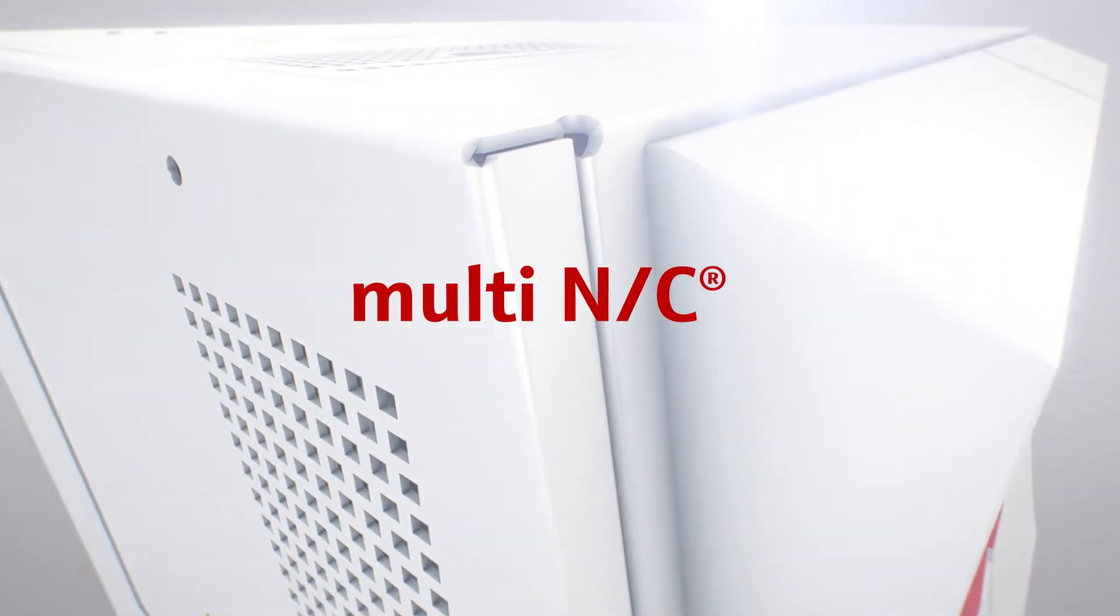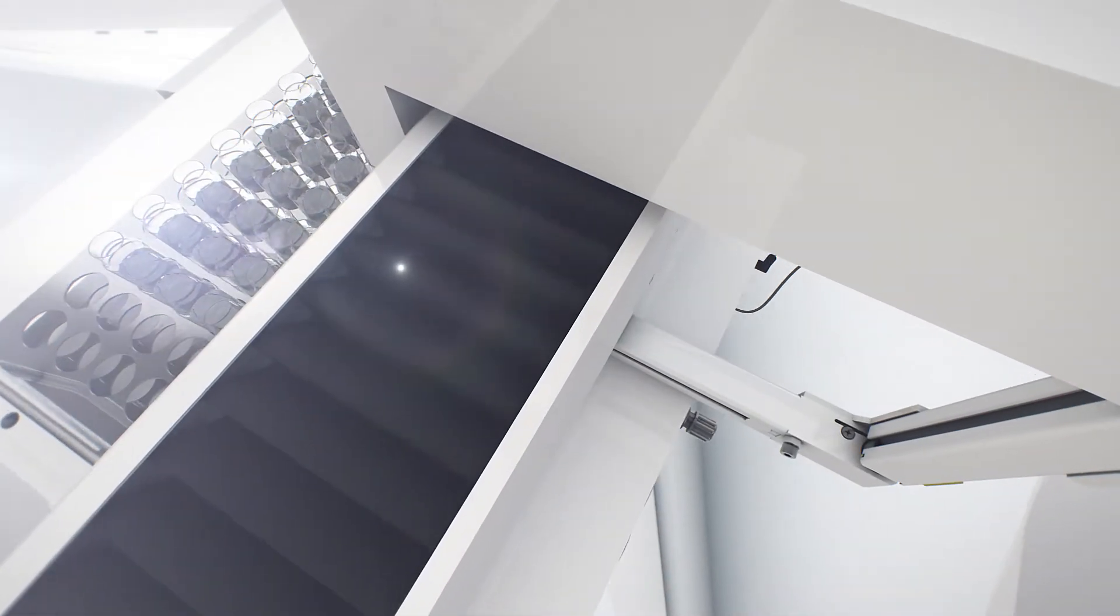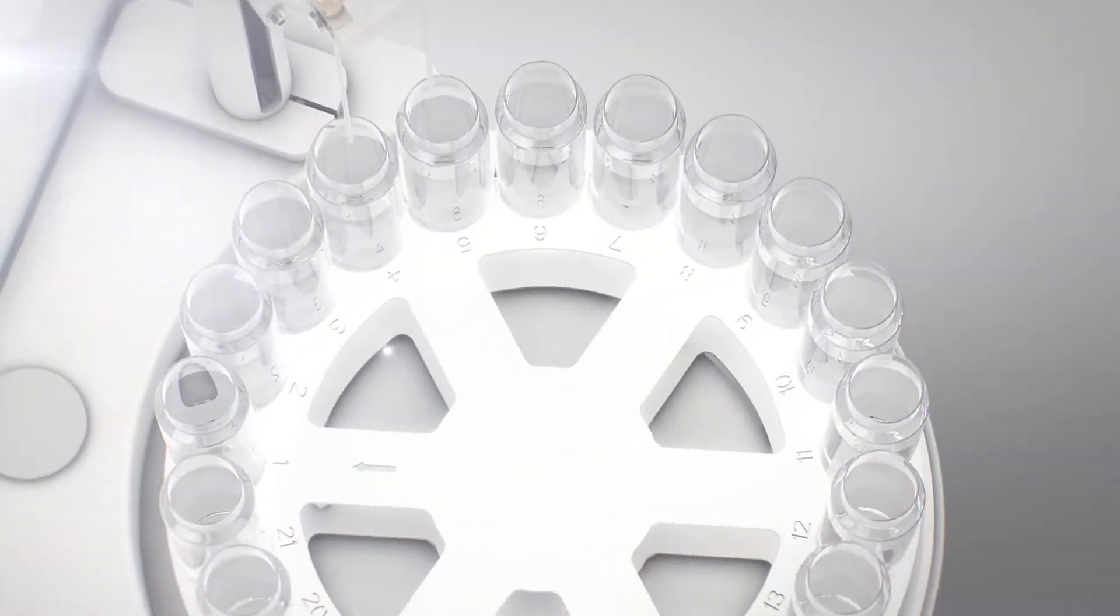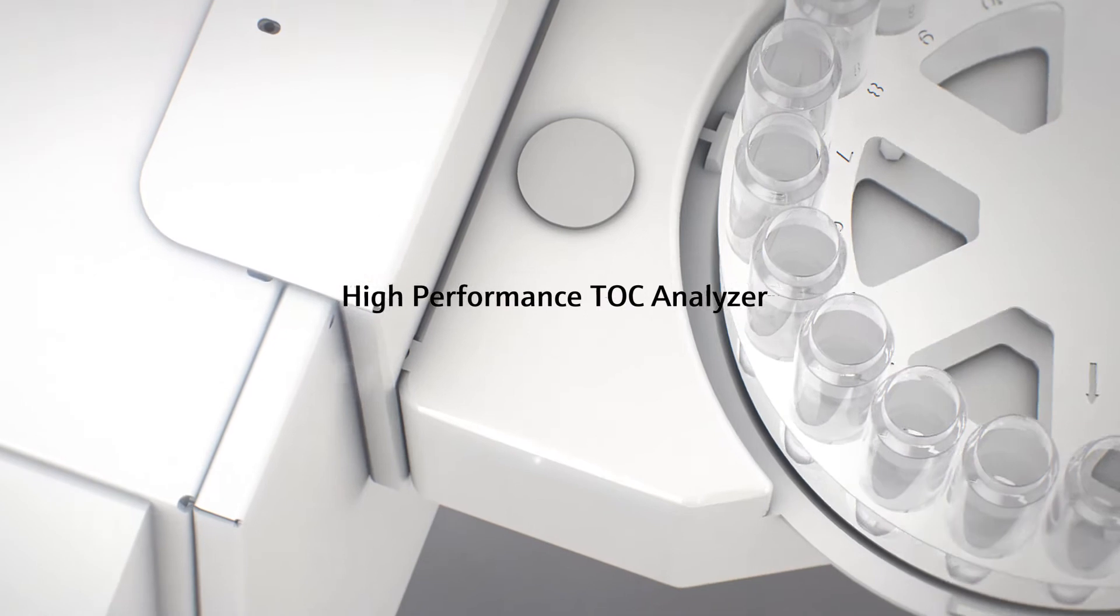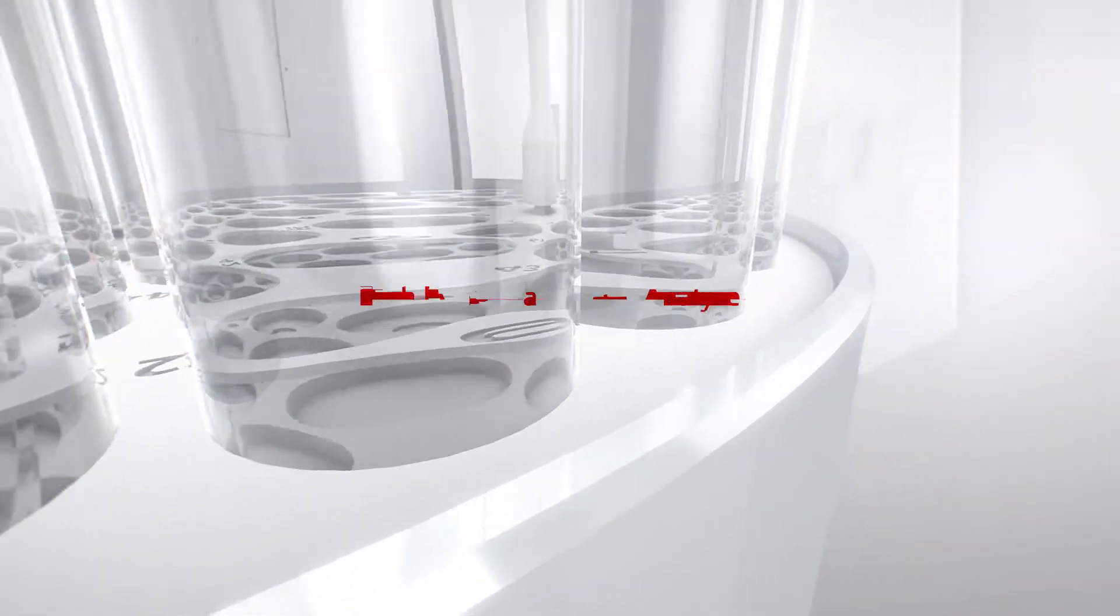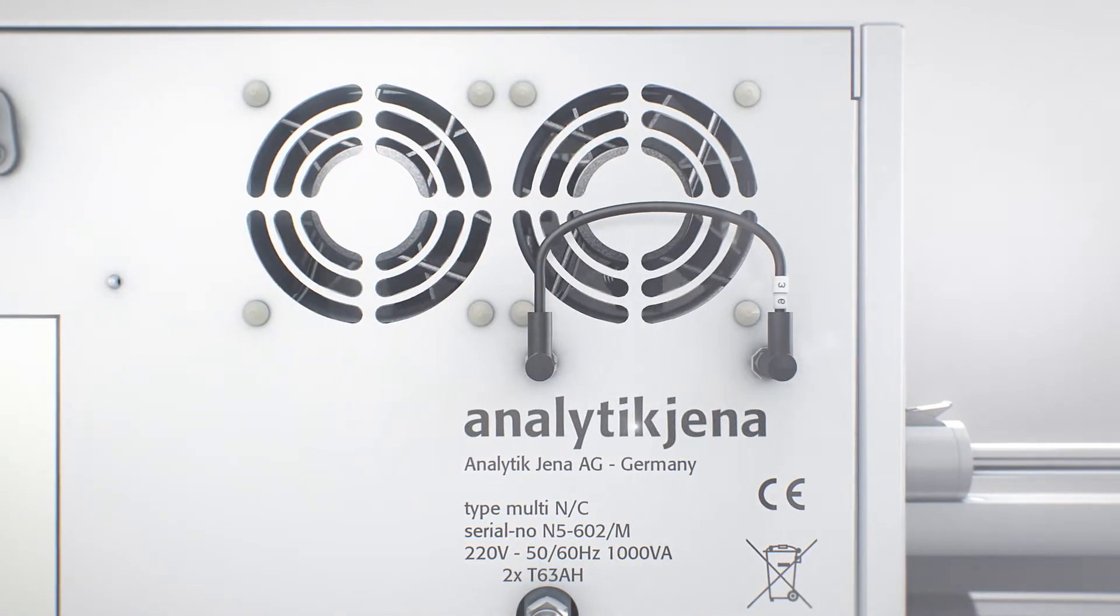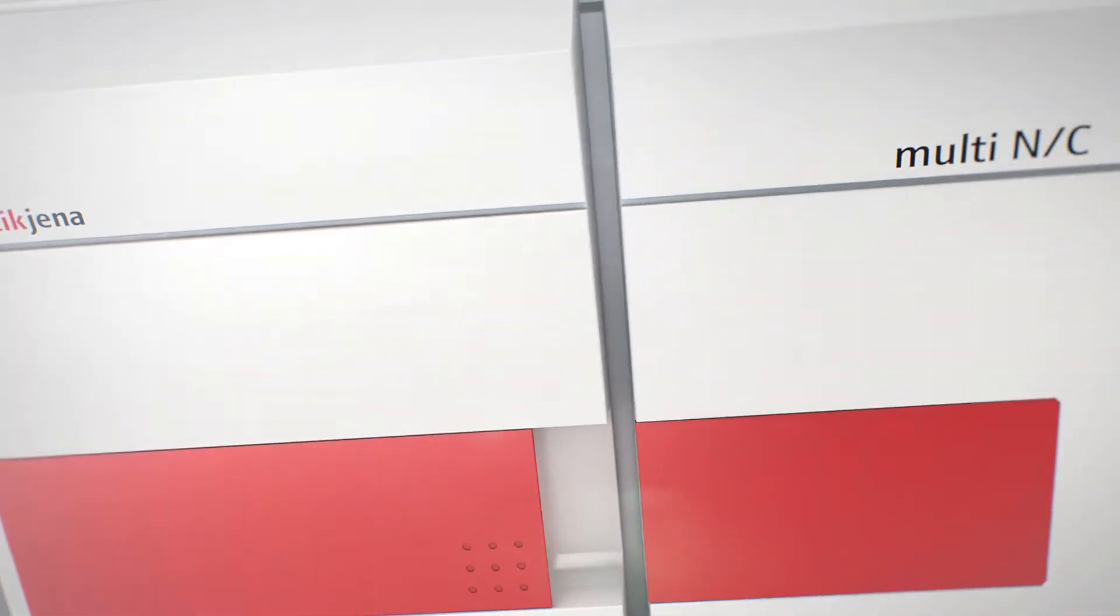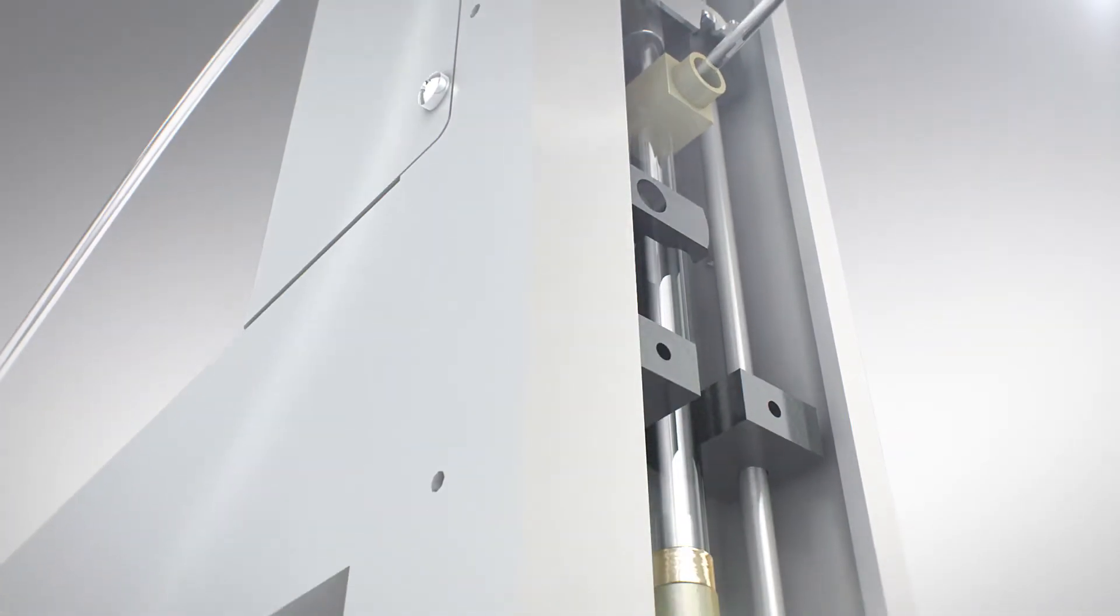Multi-NC, the high-performance TOC analyzer from Analytic Jena, satisfies any customer's needs because of its flexibility, efficiency and ease of use. Its novel technology allows the determination of TOC, NPOC, TNB, POC, TC and TIC in liquid or solid samples in one instrument without any conversion, quickly and precisely.